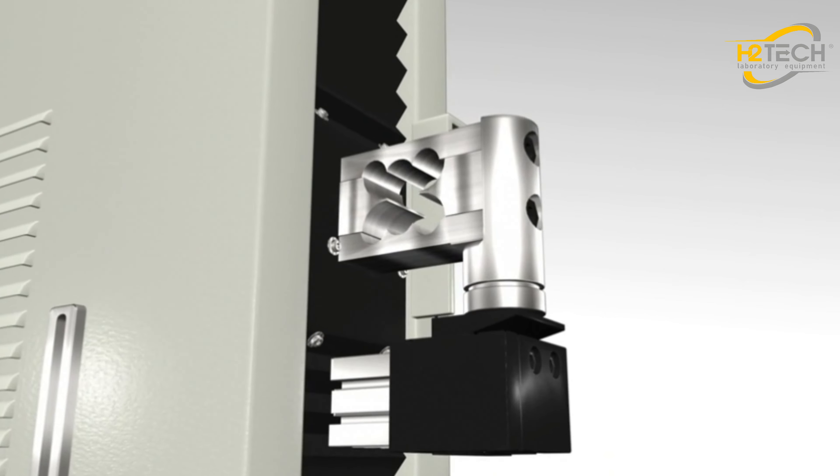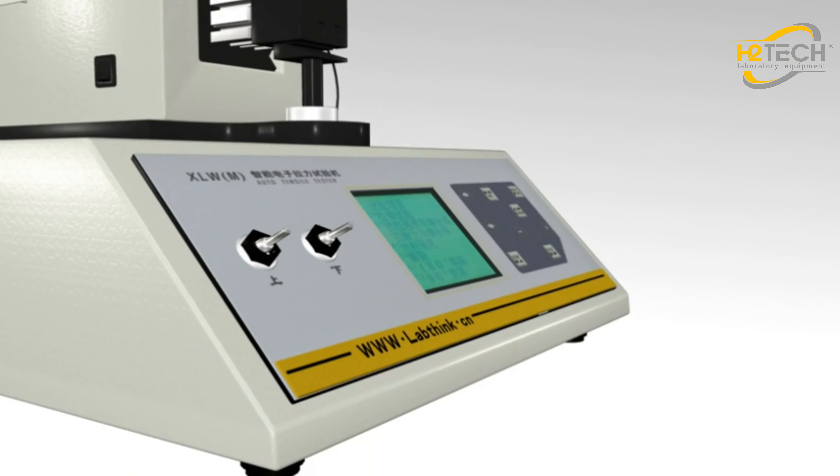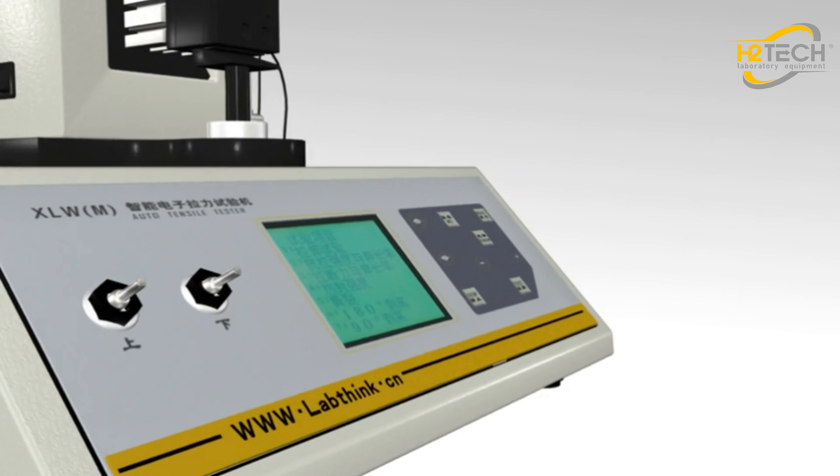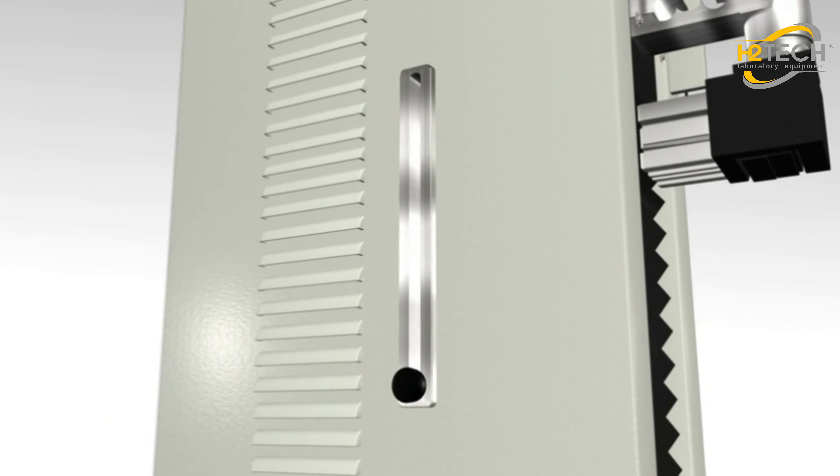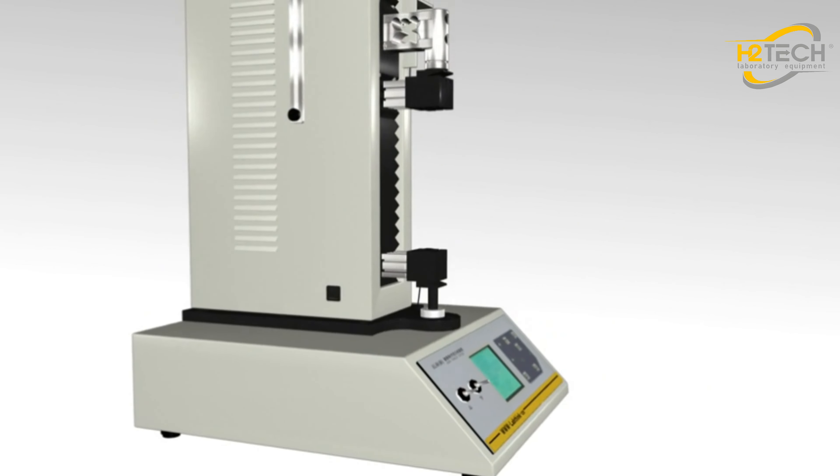XLWM has a high precision load cell and functions of power failure memory, overload protection, over travel protection and automatic position reset.